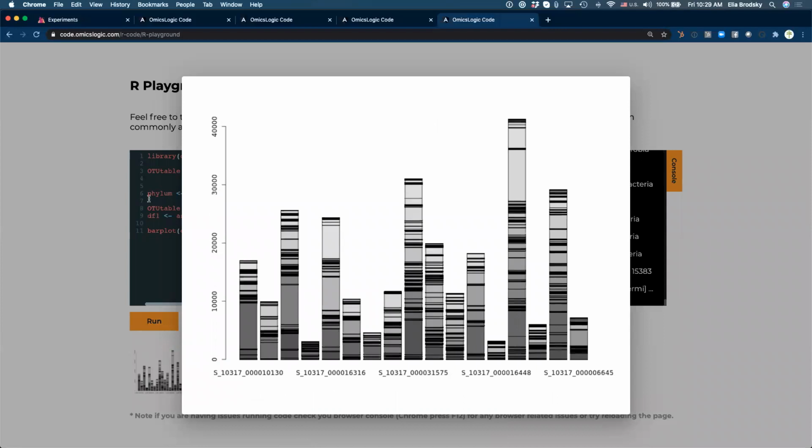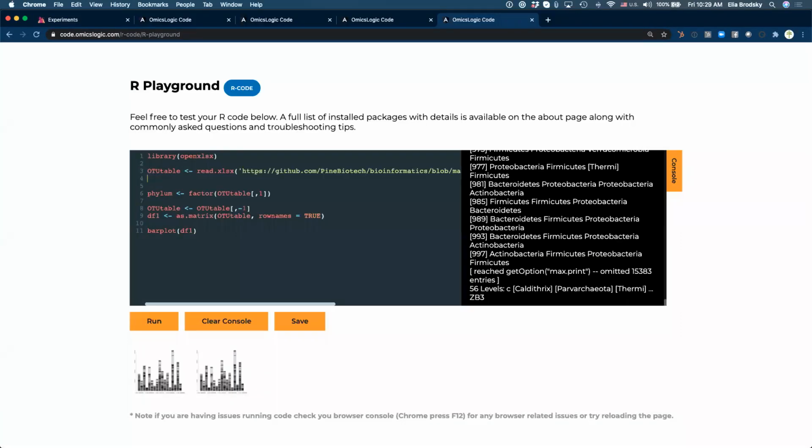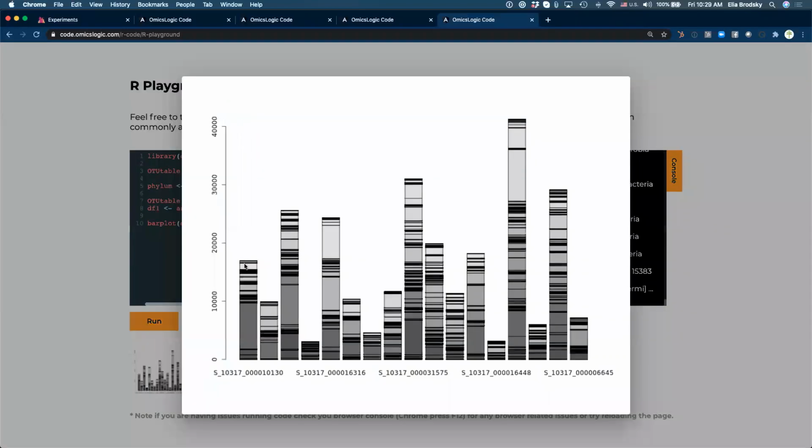So the whole trick of making a bar plot is really just to load in the data and make that data into a matrix. Really, to make a bar plot, I don't even need to store these. I'm just going to use these for my colors, but if I don't want the colors, I can just use this. And this is a stacked bar plot, right? The bar plot that we saw before had them all stacked one next to each other, and now it is stacked up in one line per sample.